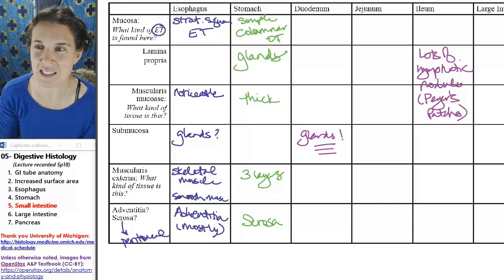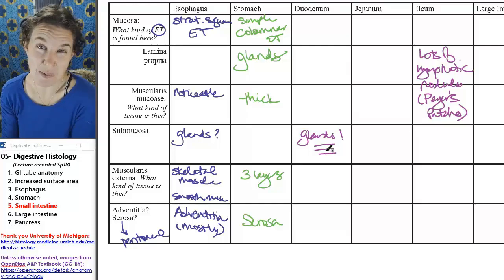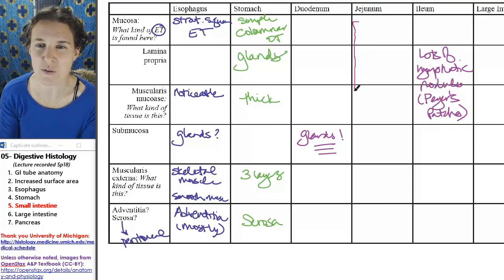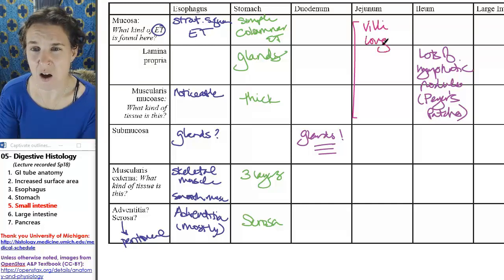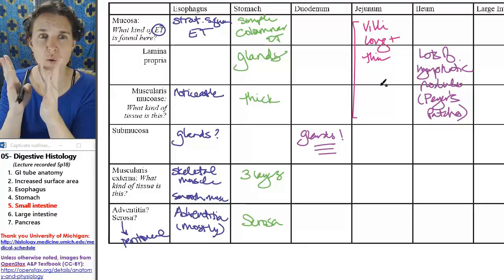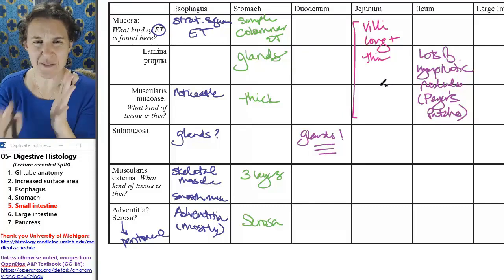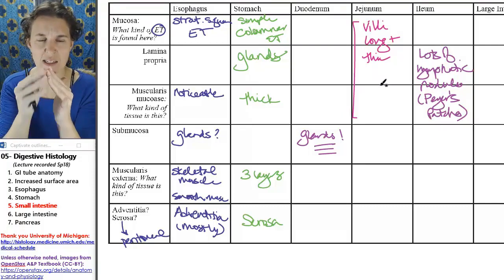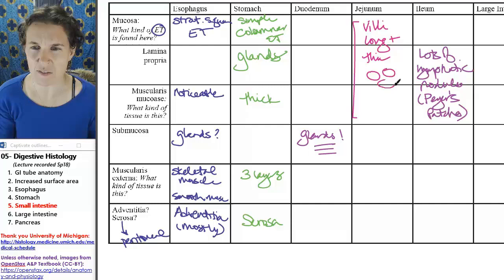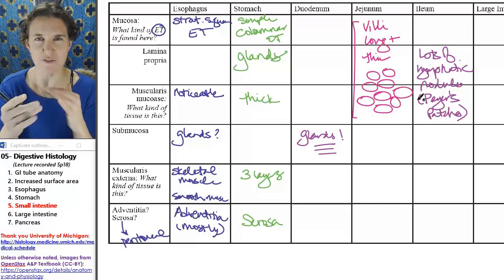Now, the jejunum is a little bit process of elimination. If it's not those other two, then maybe it's the jejunum. The distinguishing characteristic here is in the mucosa. The villi in the jejunum are long and thin. And something that sometimes happens when the villi are so long and thin is that the slices will cut the villi in these shapes that almost look like you end up with lots of circles toward the lumen. It almost looks like giraffe skin.